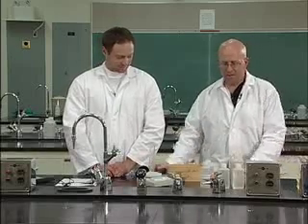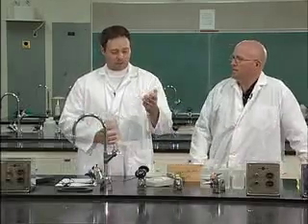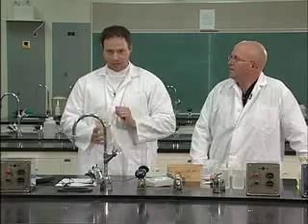What do you call this? Graduated cylinder. A graduated cylinder. Get our terms right. You're only using a graduated cylinder and water. Okay. Anytime you're using any sort of chemical glassware, for this example, we're going to be using plastic, just because it is a metal sample going into a plastic tube.